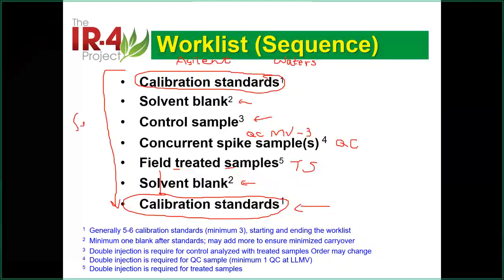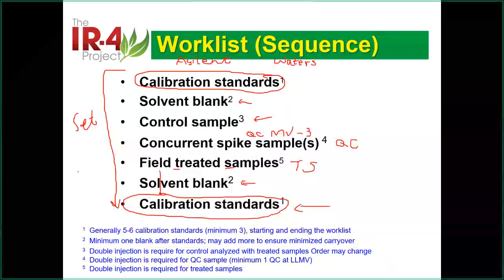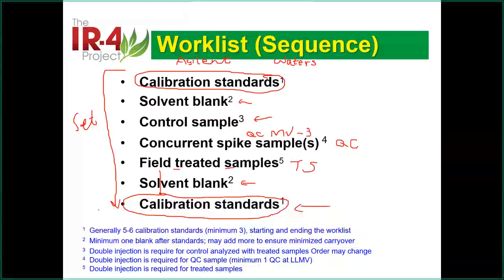So that's called a set. Although in the lab, you may call that a batch or a sequence or set or whatever you call it, it doesn't really matter.